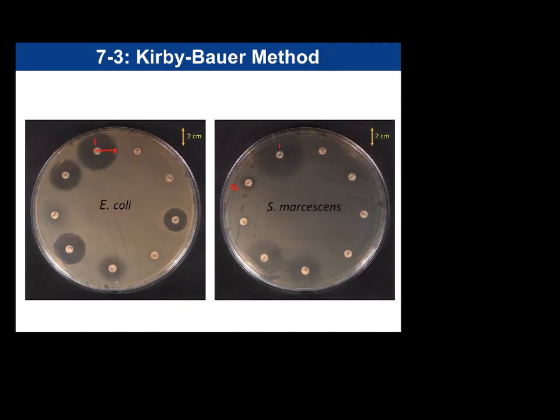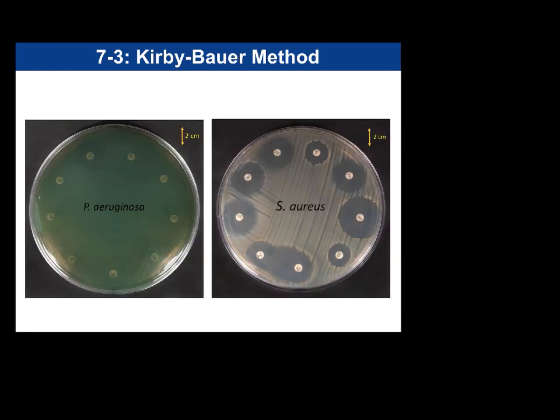So as you can see between these two plates, we've got some different results. Again, we're looking at the difference between two different species of bacteria. This is E. coli, this is Serratia marcescens. Both of these organisms are gram-negative, but again, they perform differently. You'll also notice some halos here where there's kind of a clearing, but not quite a clearing. We see that for a number of different antibiotics, but here we see a complete clearing, versus on Serratia, for this one, it's a much smaller clearing.